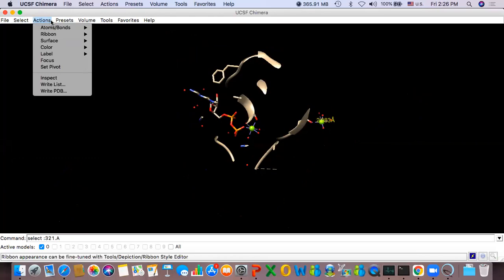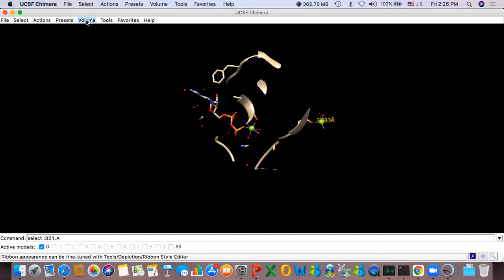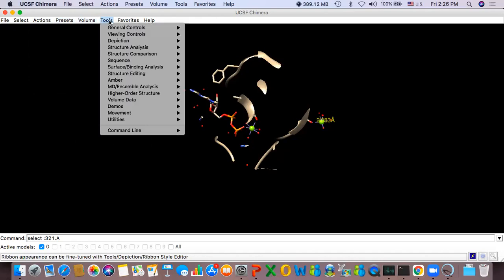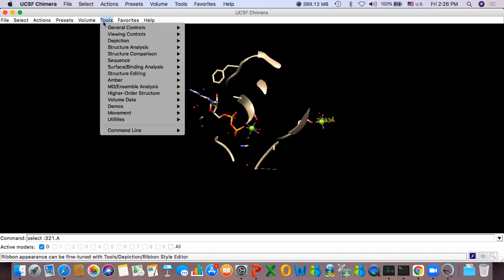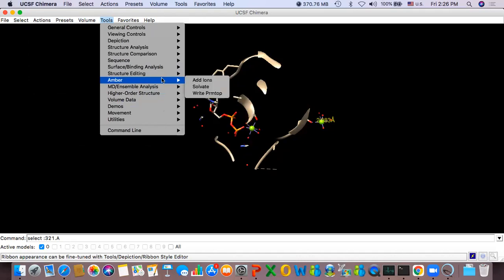No, this will not tell me. You can change the options in the sense that you use some other. For example, if you do preset or something, it will reset it. That's not how you want to do this. Let me see. Just give me a minute.